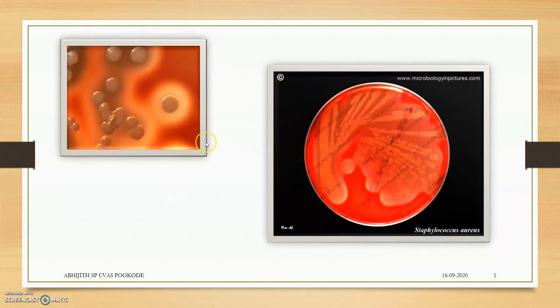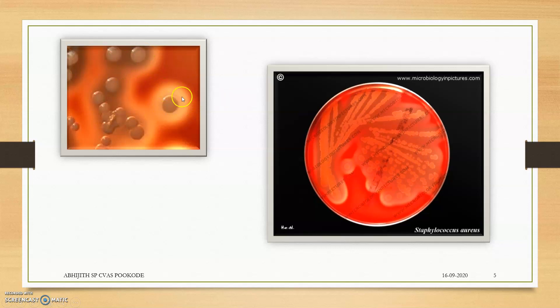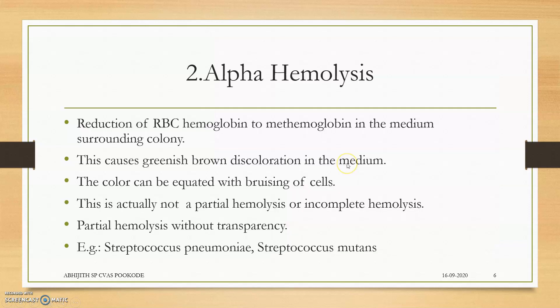Here is an example: Staphylococcus aureus producing beta hemolysis. The hemolysis zone is a completely transparent, clear zone around the colony. This is the hemolysis point.